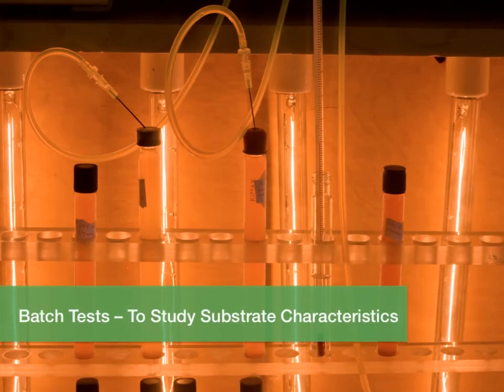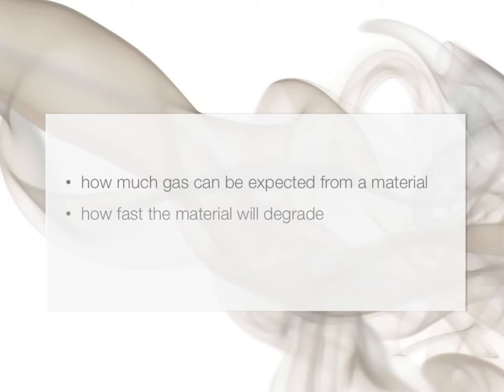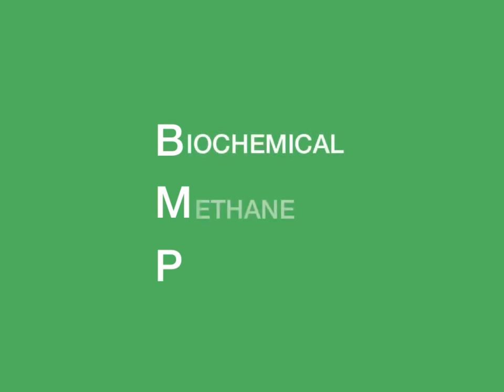Batch tests to study substrate characteristics. Batch tests tell us how much gas can be expected from a material. They also tell us to some extent how fast the material will degrade and the metabolic activity of the microorganism. Batch tests are often called BMP, biochemical methane potential tests, and are the most convenient way to analyze a substrate for biogas production.